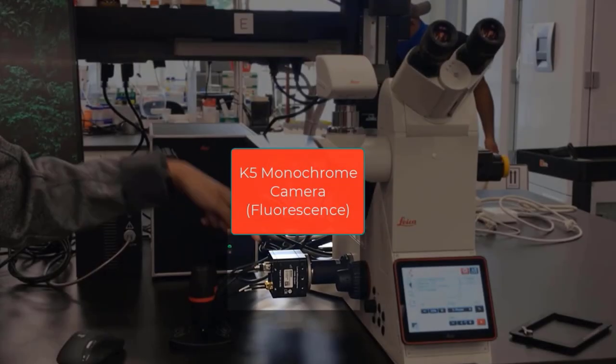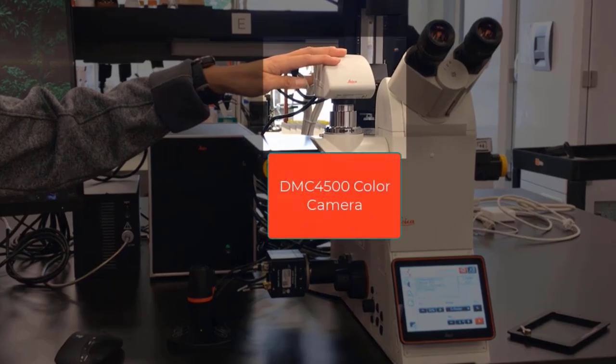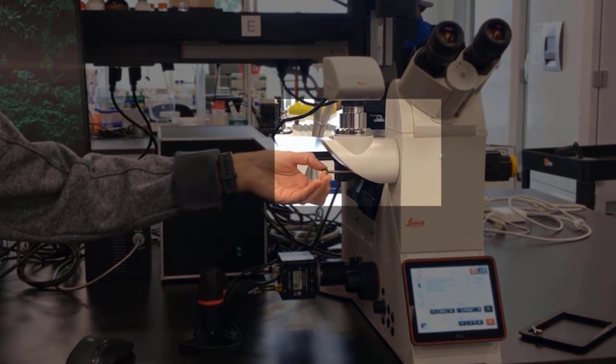There are two cameras with this microscope. One is the K5 monochrome camera, and the other is a DMC 4500 color camera. To send light to the color camera, you have to pull this knob out.